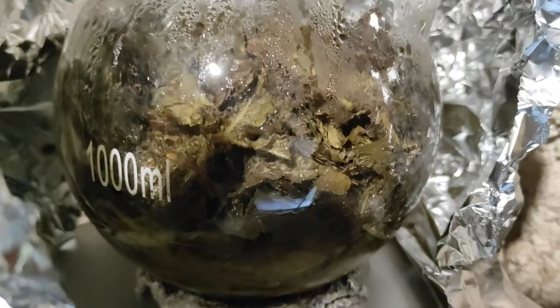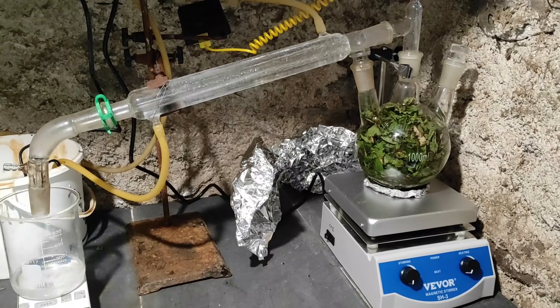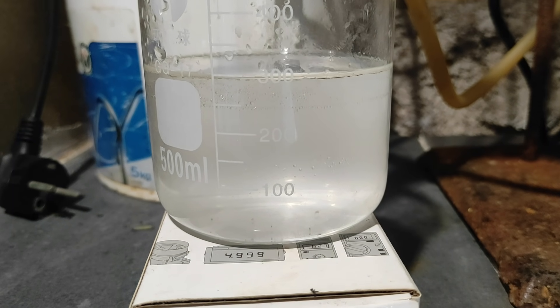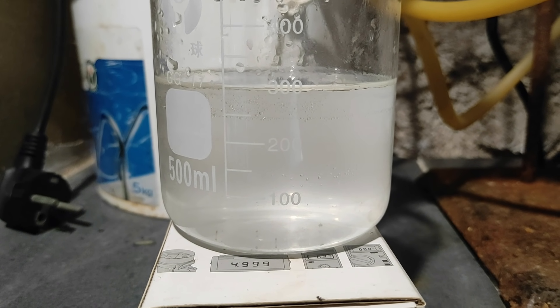When the distillate is not cloudy anymore, most of the menthol should be extracted. As you can see, the mint leaves lost their colour in the hot steam. When this was done, I removed the used leaves and put a new batch in. After all the batches, we are left with about 300ml of water containing some menthol.